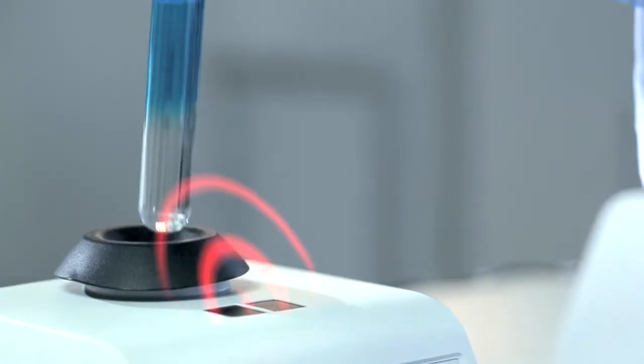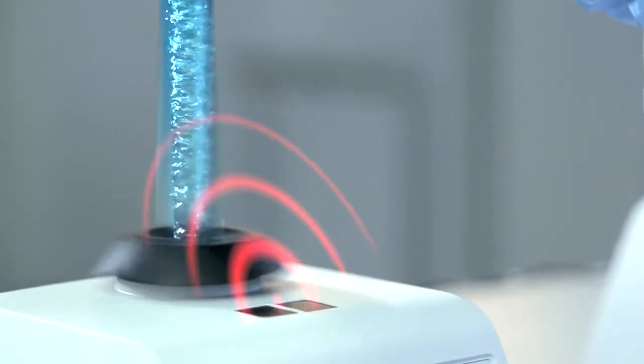Welp Scientifica TX4, a vortex of modernity in your lab.